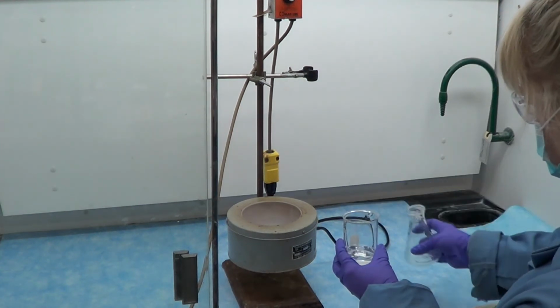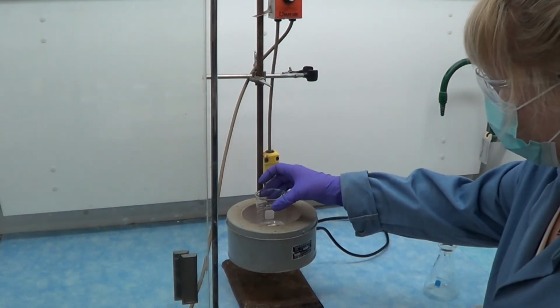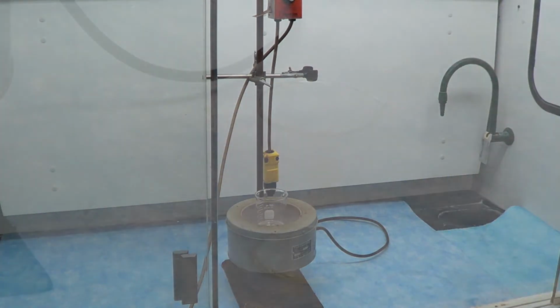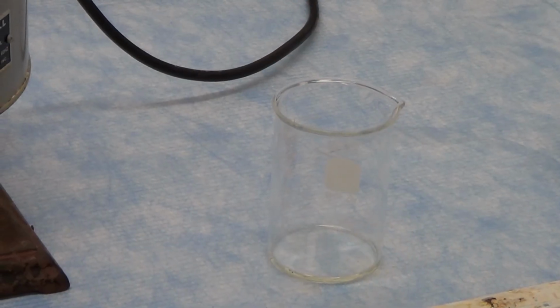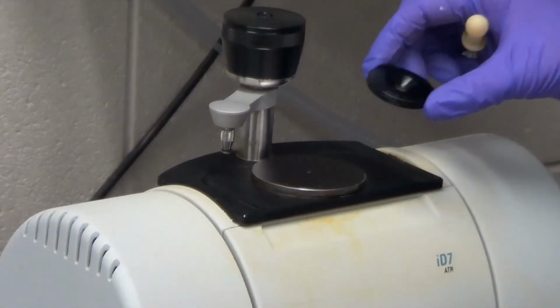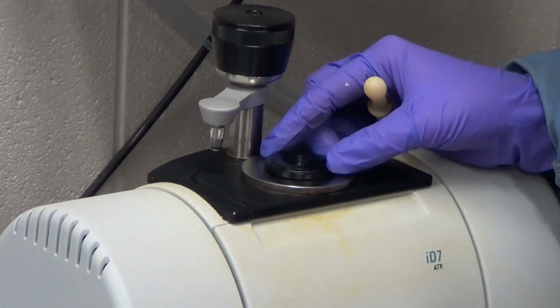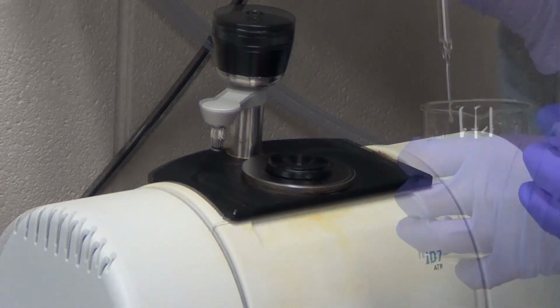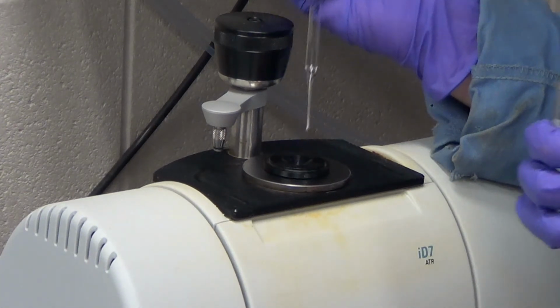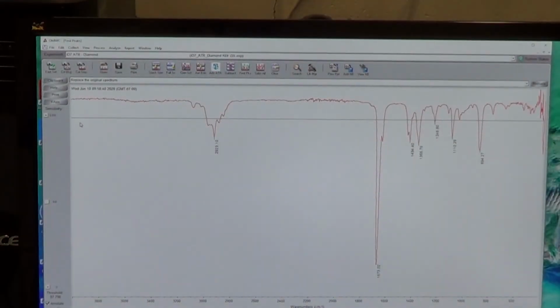Once the TLC and the Baeyer test are complete, the solution is then concentrated by evaporating the DCM, leaving only the extracted carvone. The concentrated carvone is then analyzed by IR. Before taking the sample spectrum, be sure to take a good background. Then, add a small amount of carvone to the ATR optical sample and start taking the spectrum. The spectrum is then processed to find any peaks and printed.